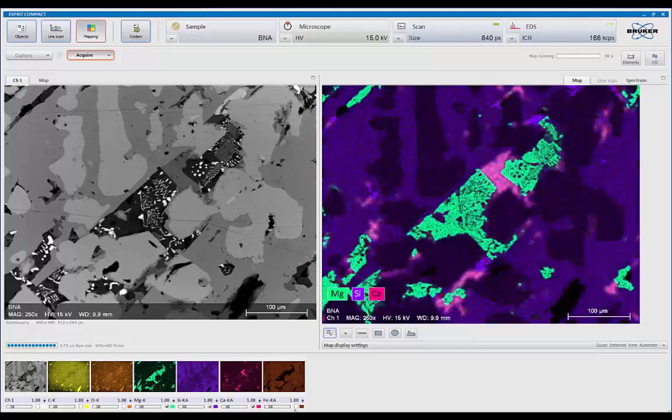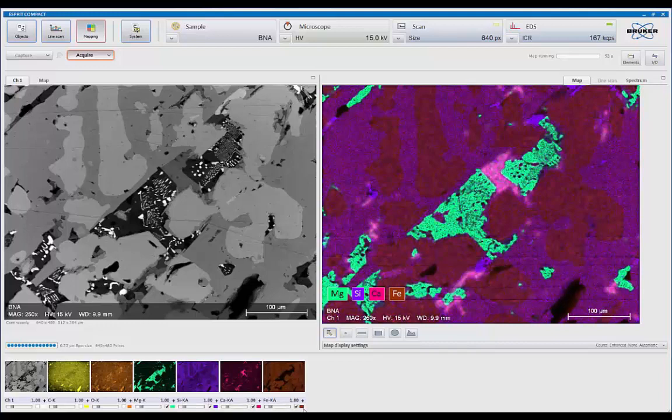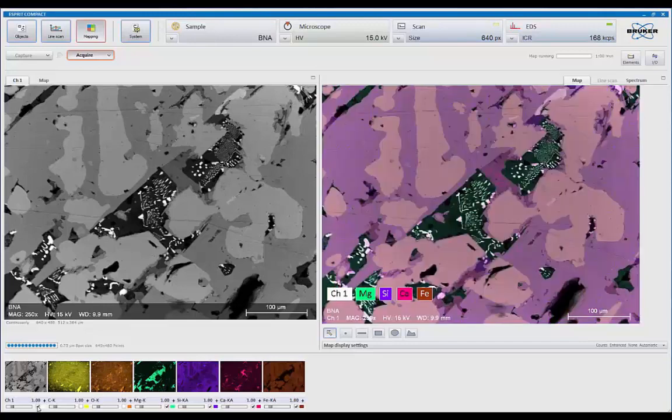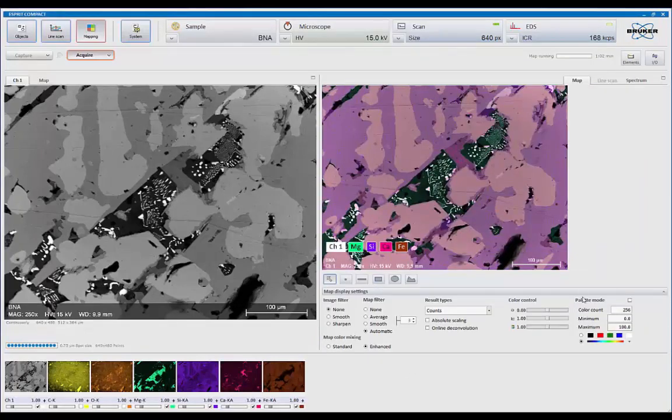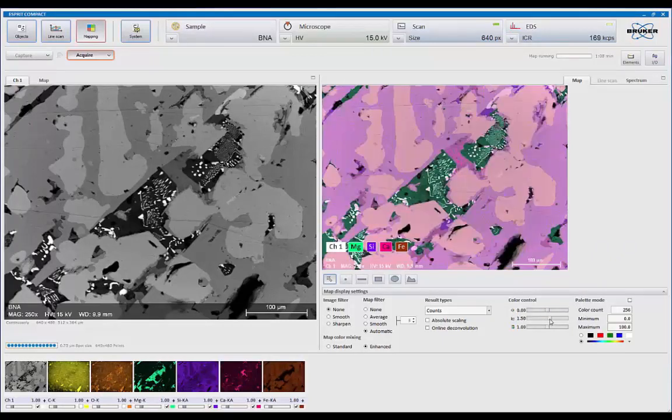We can also now put in silicon. Add in iron. So as I add in the elements, we see it also will add colors, so this blends colors as well. And then we can add the image in and see how it compares.